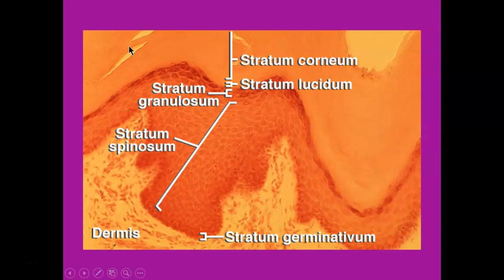All right, so here you can see where the skin is tearing apart. Remember, these cells have lost the ability to maintain their integrity and their connections to each other, so this layer is constantly being shed. But remember, our stratum basale down here is constantly undergoing mitosis and new cells being pushed up, up, up, up, up.